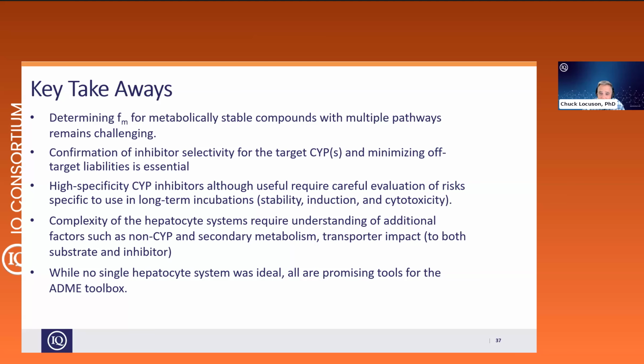I think conversely, if you have a drug that shows no measurable depletion, so really low turnover, and has multiple enzymatic pathways, I think we're going to need to characterize the complete in vitro disposition and really know all the metabolites, because these are static systems. And if you build up certain metabolites, they may be doing other things. They're going to change your results.